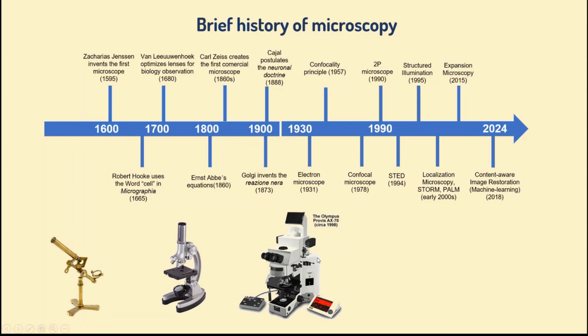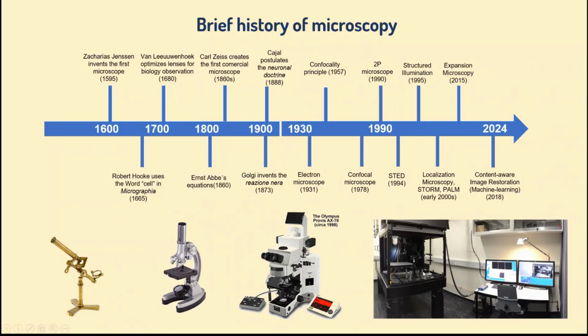And usually the microscopes now are much more complex. Normally they are custom made. They have very customized parts to achieve maximal resolution or maximal intensity or whatever. And normally they occupy a full room with several monitors and screens, and normally they look like this. In this case, it's what we call a setup. It's not a microscope anymore. It's a setup because it has different devices attached to it. Not only the microscope, but also electrophysiology or optogenetics or different kinds of possibilities.